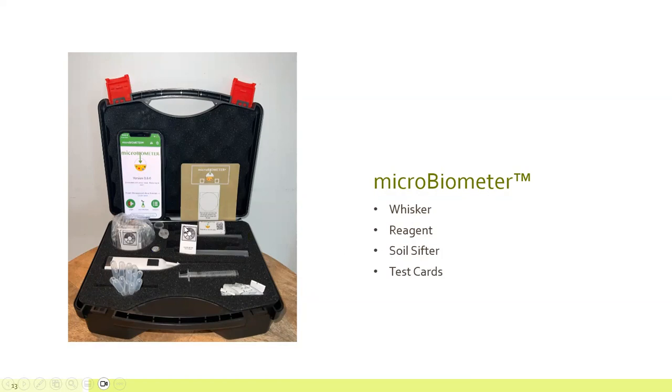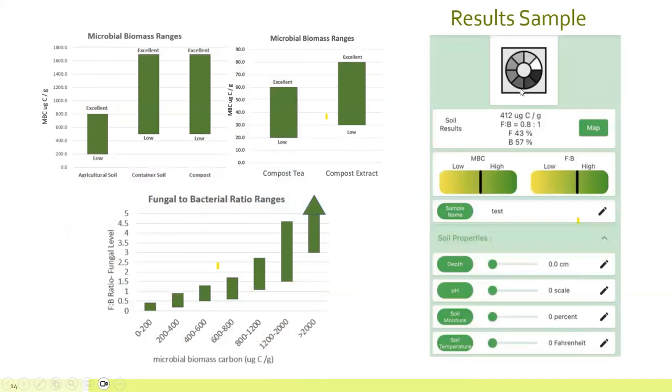It uses, and actually we can go to the next slide. So it uses this color gradient here. It uses grayscale. This is something that you actually, it's an app on your phone, and this is a screenshot of the much larger things that you get from here. But in general, when you're looking at the soil sample results, unlike the microscope, you're not getting to understand what the diversity looks like, but you're getting to see the total microbial population, right?